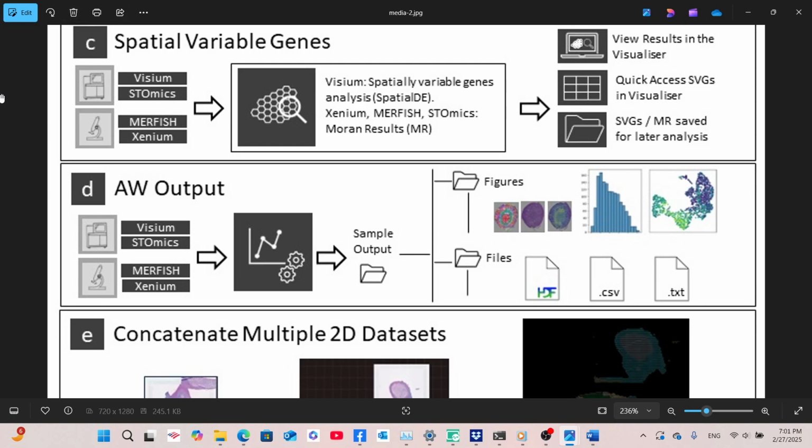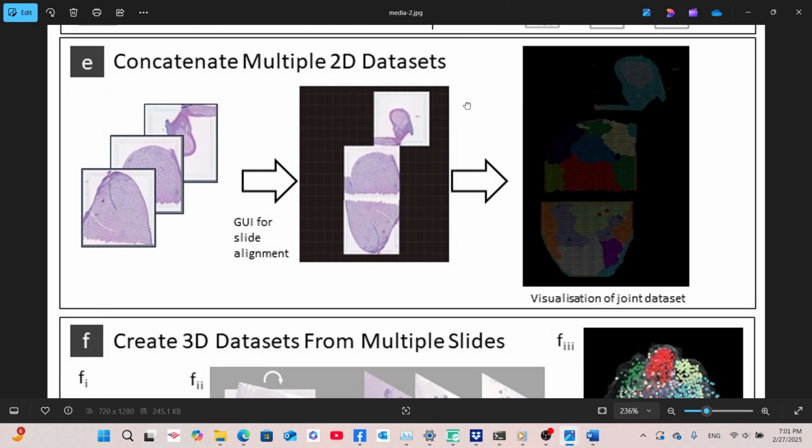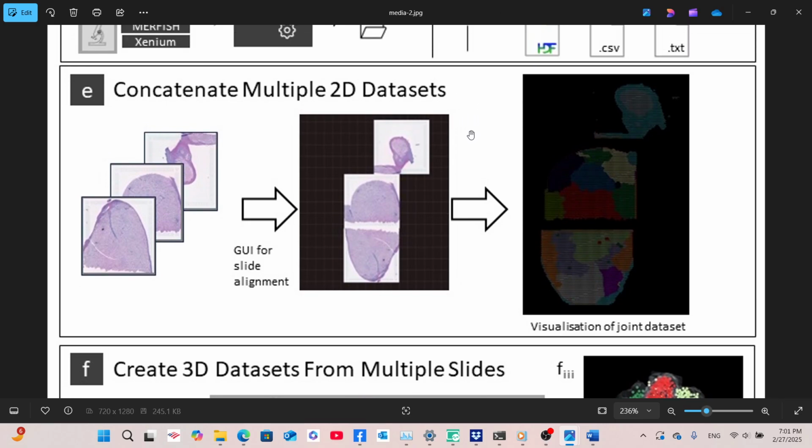After processing their data through the automated workflow (AW), or loading the requisite files, irrespective of the data platform used, users can explore their datasets within the visualizer. The visualizer offers an array of interactive features designed with input from biologists to create intuitive analysis tools and ensure availability of the right resources to address various biological questions. These features support the systematic exploration and comparison of gene expression data across samples within a 2D desktop or VR environment. Supplementary Figure 4.5, Supplementary Table 3.